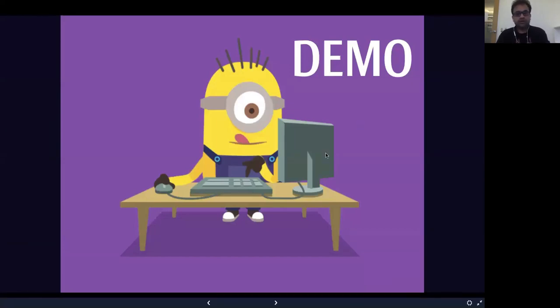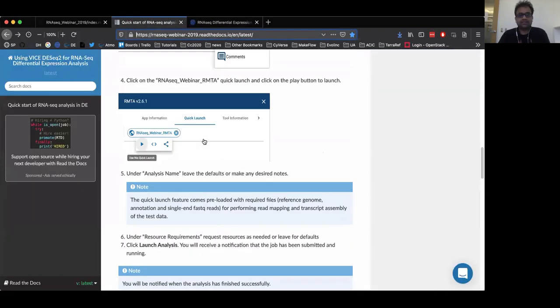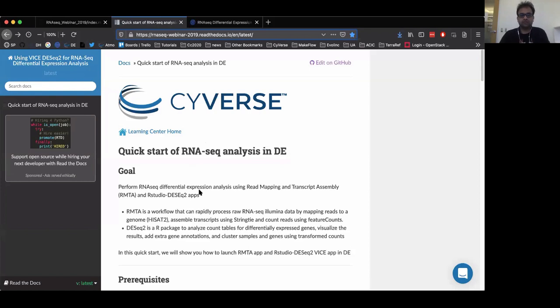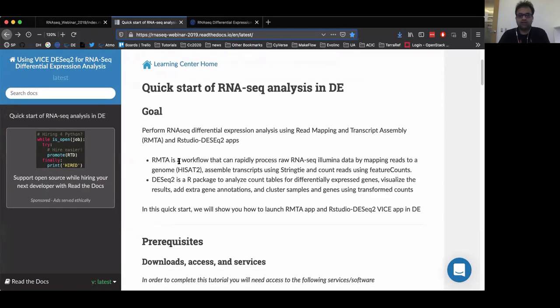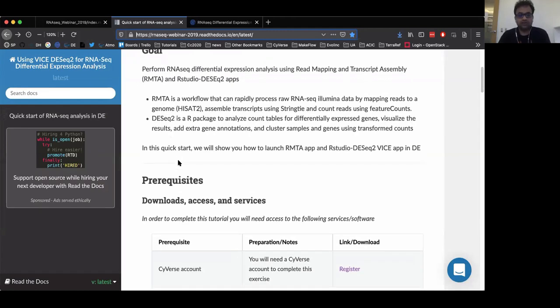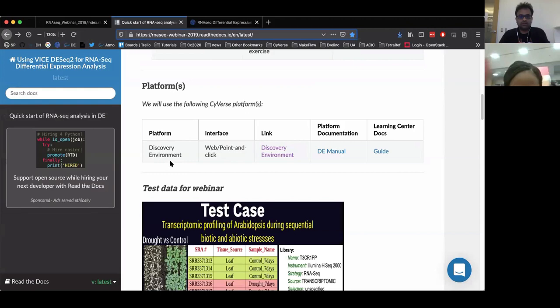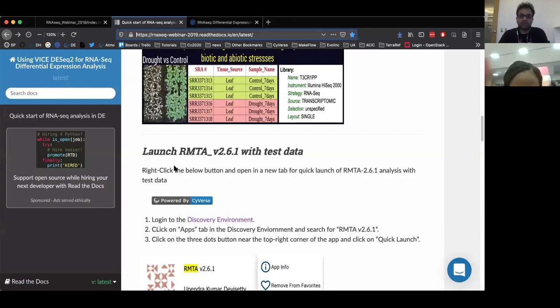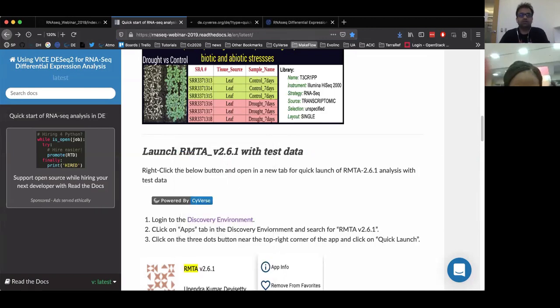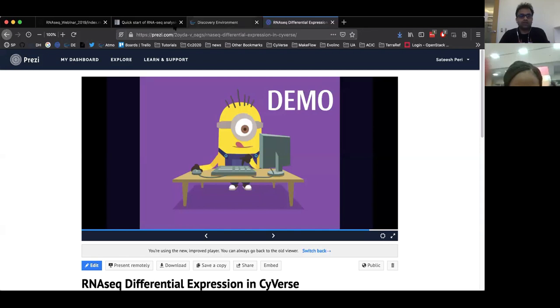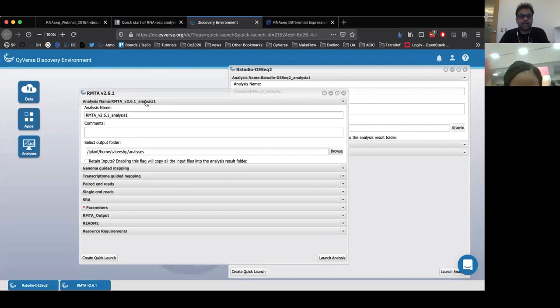If you are following the tutorial along with me, I will navigate to the quick start page for today's webinar. You will find all the necessary instructions on this wiki page, which you can follow right now or at your own pace. The prerequisites are a Cyverse account and the discovery environment. To launch RMTA with test data, we have provided a quick launch button. Right click on the button that says 'powered by Cyverse' and click open in a new tab, which will log you in to the discovery environment and open the RMTA app pre-launched for you.